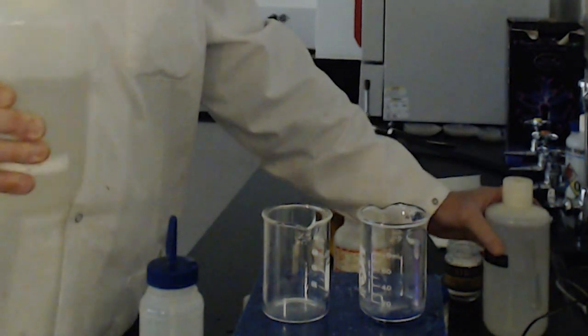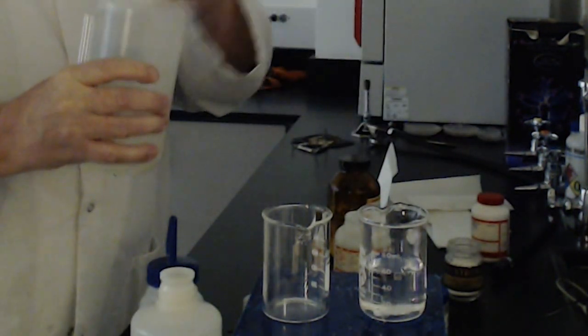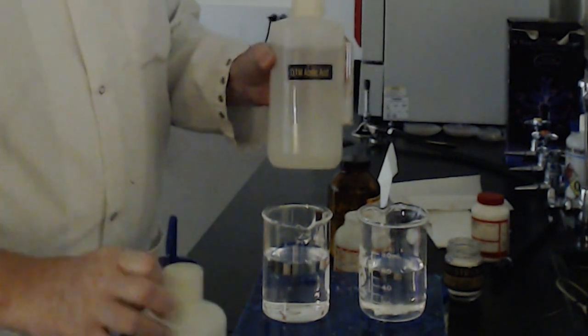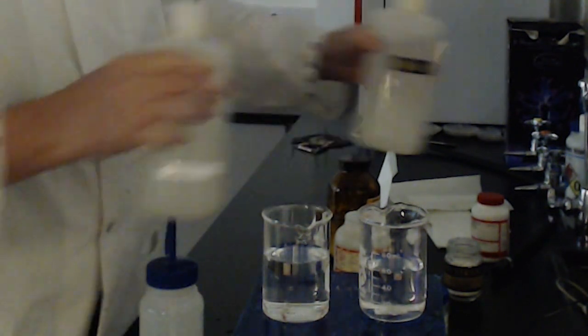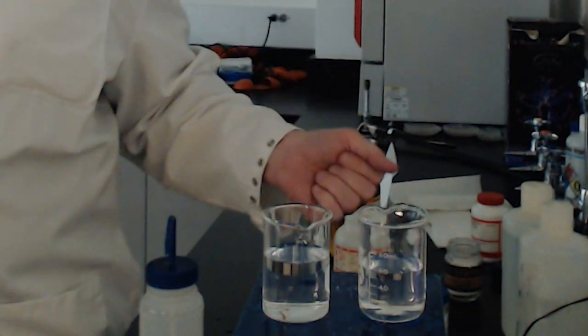So I'm going to use two acids of everyday life. The one here on your right is stomach acid. The one here on your left is acetic acid, also known as vinegar. Now, what we've done is we've made the exact same concentration of compound dissolved in water. These are both 0.1 molar solutions. So, same amount of compounds dissolved into the pure water.